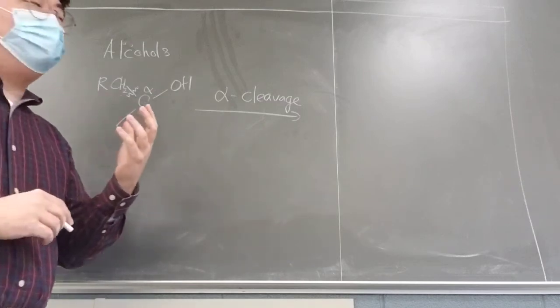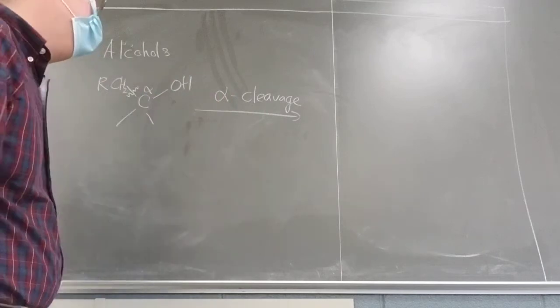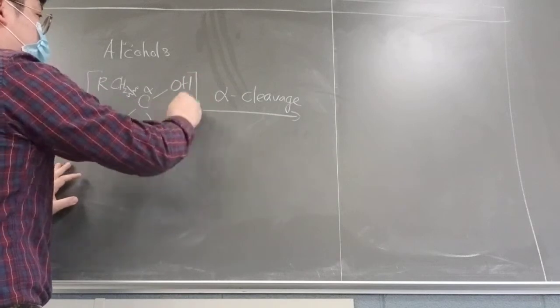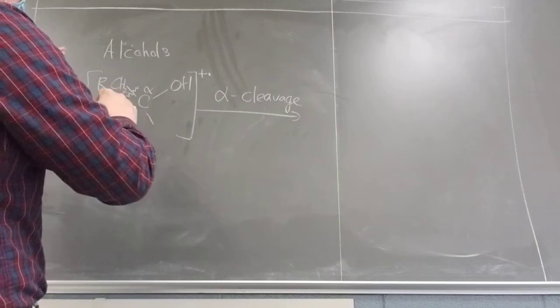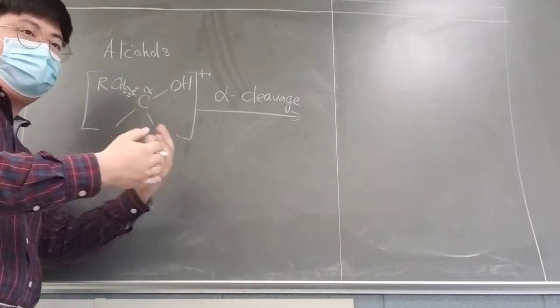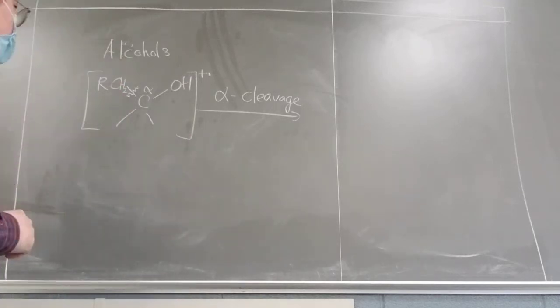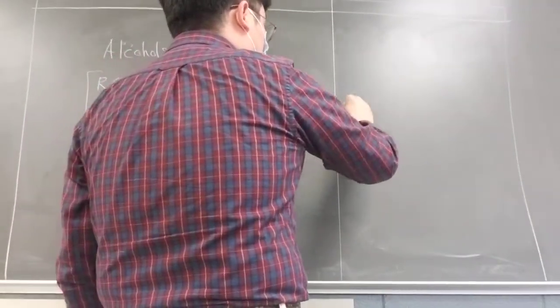Around that alpha carbon, we're going to have some breakage of the bond near the functional group. With an electron bombardment, this might be where you will see, most of the time, the breakage of the bonds when you end up with lots of different types of small fragments from the compound in the mass spec. Whenever it happens, this one will break apart.